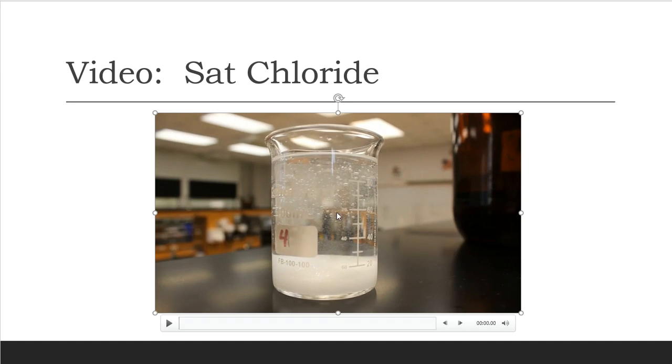And folks, it almost looks like a gel that sits on top, but it's not. It's not jelly. It's very liquidy. It looks like water. I don't know really why it looks like that in the beaker, but it does. So don't make that as an observation, please. So it is very liquidy, just like water.